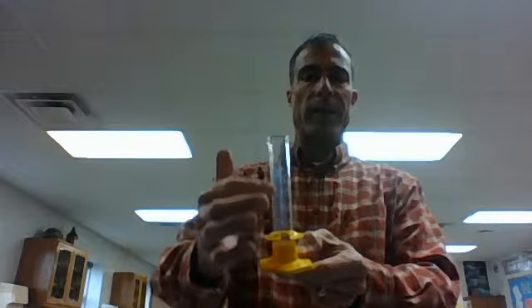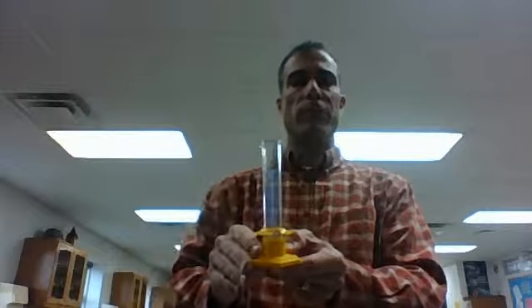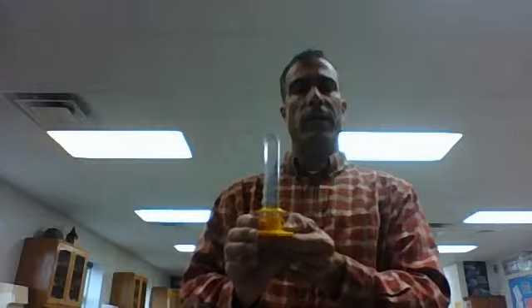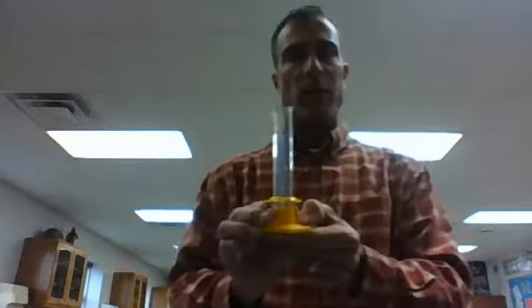The next item is also used for measuring liquids. It is a graduated cylinder. You can see that there are several markings on here. They call it graduated because of those markings that you can use it for measuring liquids. This is also measured in milliliters, and that's what we measure liquids with when we are measuring in science, milliliters. So this is a graduated cylinder.